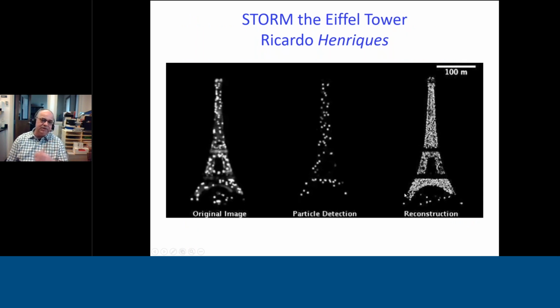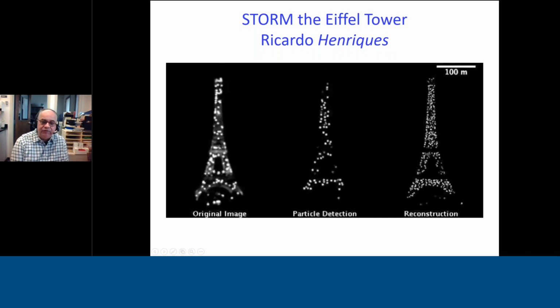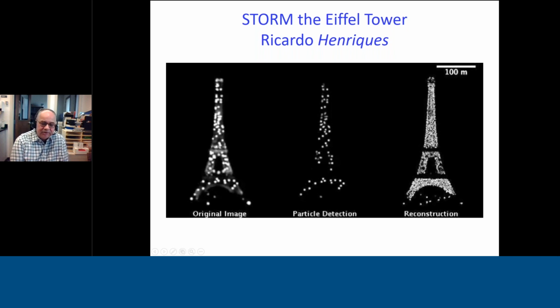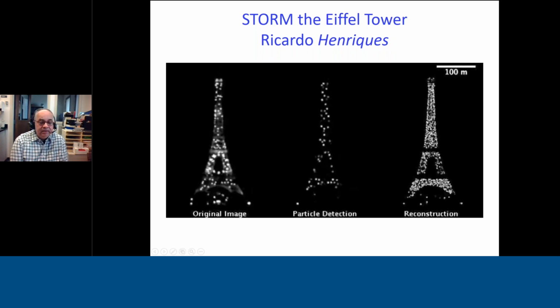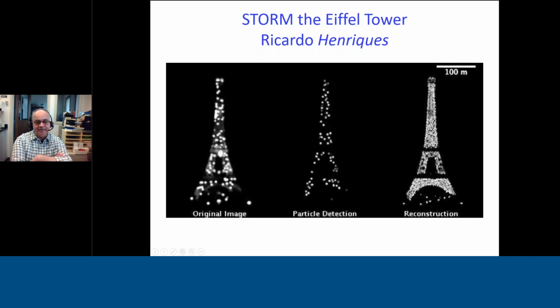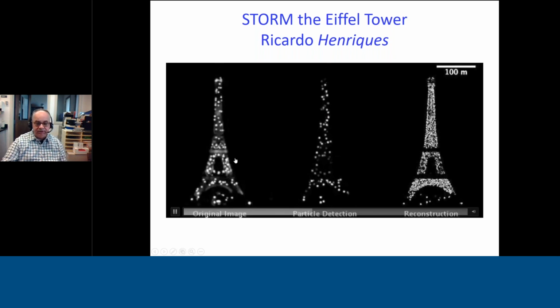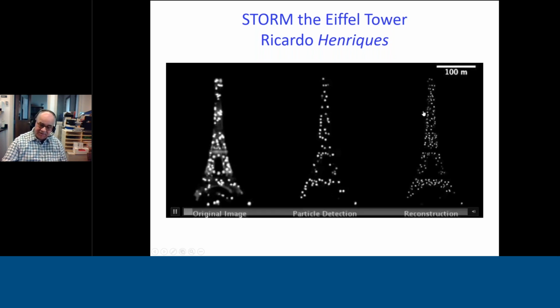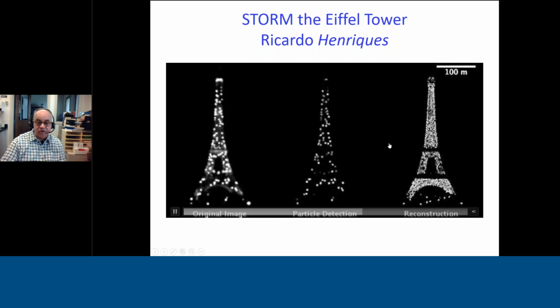Let me show that little video from Ricardo Henriques. It's already, I think, something like 20 years old. He published that on YouTube to illustrate the functioning of the software he published, QuickPALM, at the time when single molecule localization became a thing. He was a postdoc in Paris at the time. He went to the Eiffel Tower at night and took with his camera a time series of images of the blinking lights on the Eiffel Tower. He fed his algorithm with that, which would detect the bright spots and calculate the center of mass, and then reconstruct the shape of the Eiffel Tower. That's basically exactly how any form of single molecule localization microscopy works.